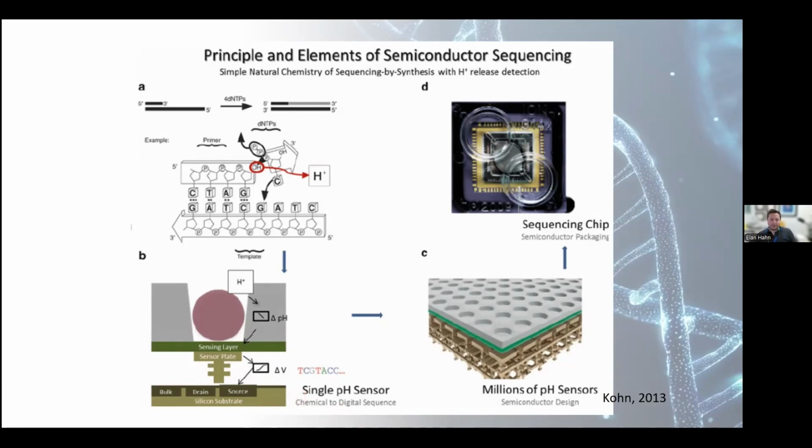And if there are multiple in a row, then they'll get a bigger change in pH. And this change in pH is linear up to 5. So if there is a repeat of 5 of the same bases in a row, then we start to lose sensitivity in detecting if it's 4, 5, 6, 7, or 8 A's or G's in a row. It's not as accurate. And having multiple of the same nucleotide in a row is called a homopolymer, and it's a common source of error or artifact in amplicon-based technologies, specifically with the Ion Torrent platform.